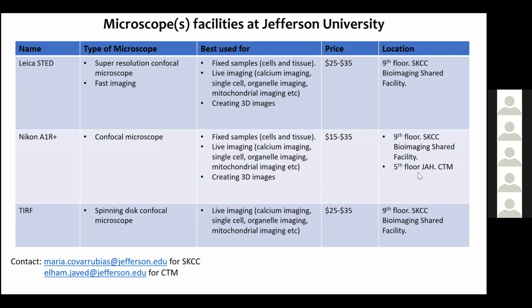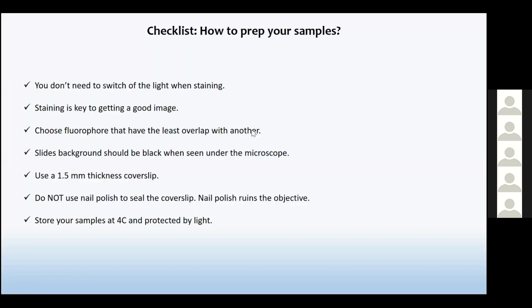So moving on. Now that you have decided which microscope to use and where they're available, this is a simple checklist on how to prep your samples, because remember that your best images are going to come out if your staining is spot on. That is the key to getting a good image.